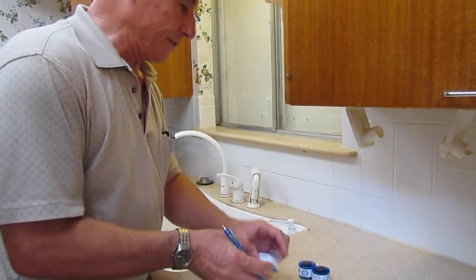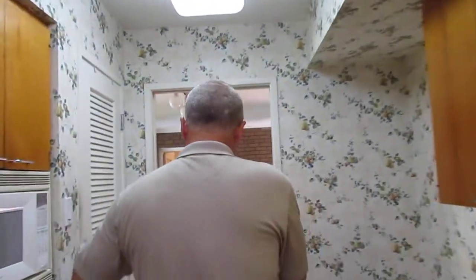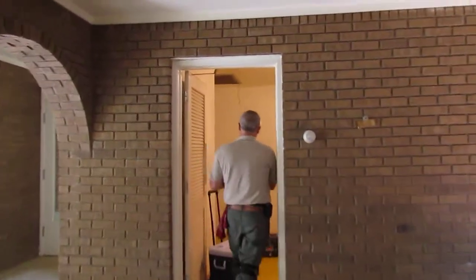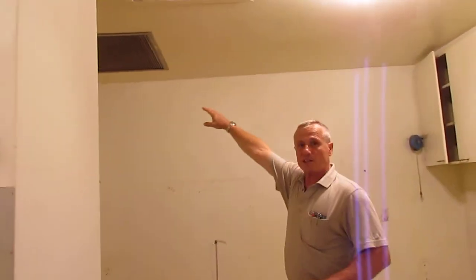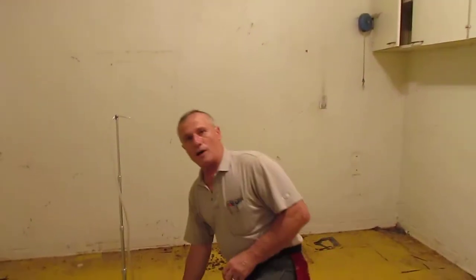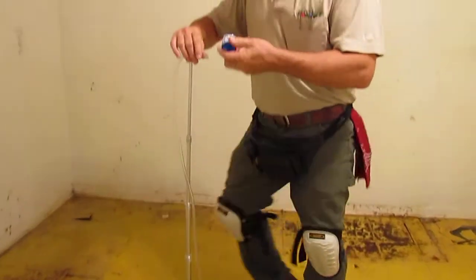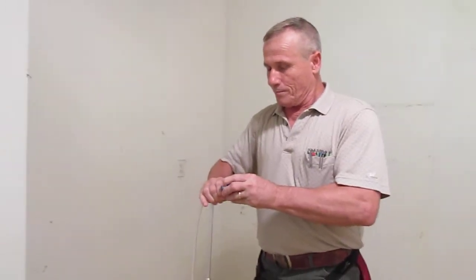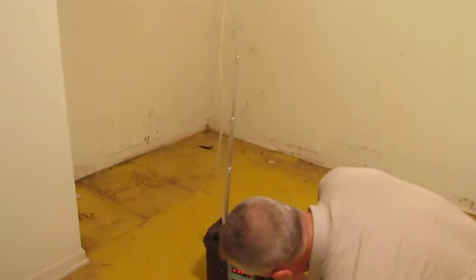I've got the cassettes already marked. We're going to do them at the air return — this one in particular is going to be at the laundry room. As you can see, we have an air return in this laundry room. This is our pump, and what I do is I put my impaction cassette at the end, right here. It has to be three feet up in the air, minimum. We set the pump for five minutes — it's already set.